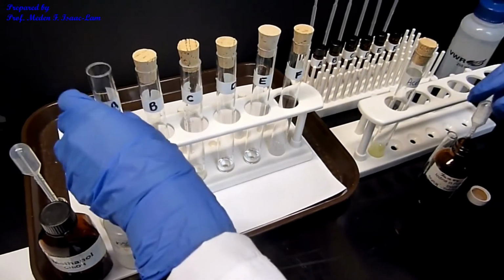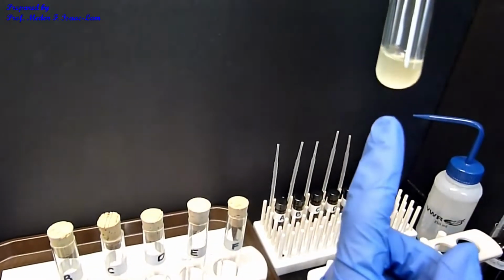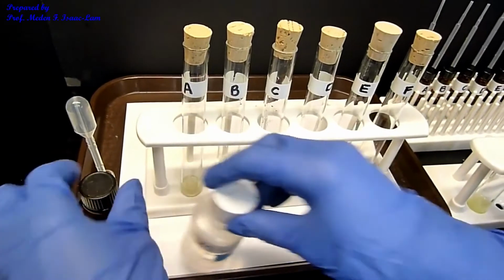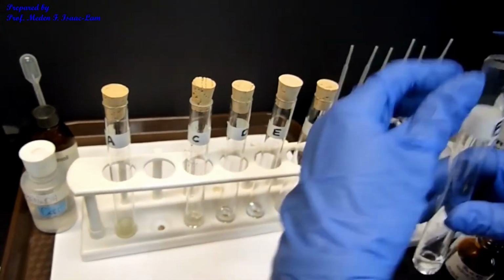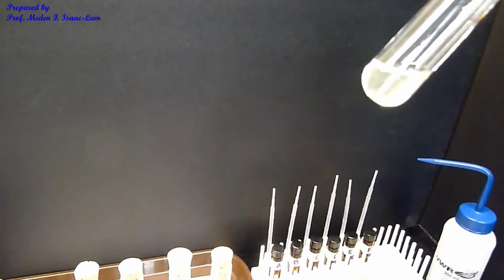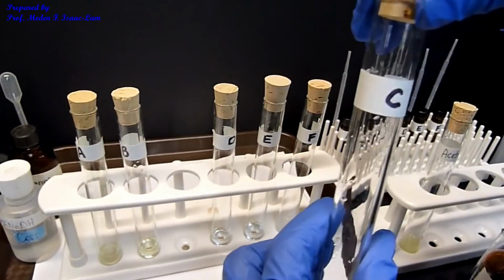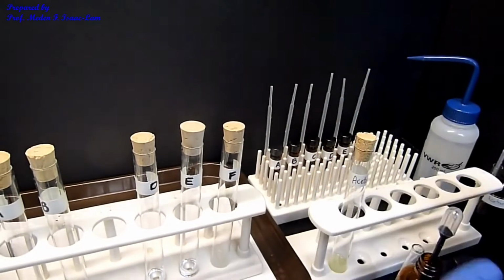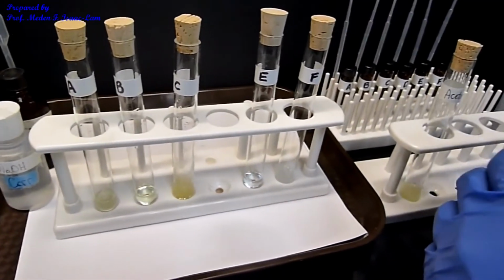So I'm going to do now for each of the unknowns. And then I'm going to shake it. So it's different. Okay, so I don't see yellow precipitation. So I'm going to do it for all of the unknowns. So B, I'm now doing B, unknown B. So 10 drops. And then C, unknown C. Just going to add first everything and then we will compare the results.